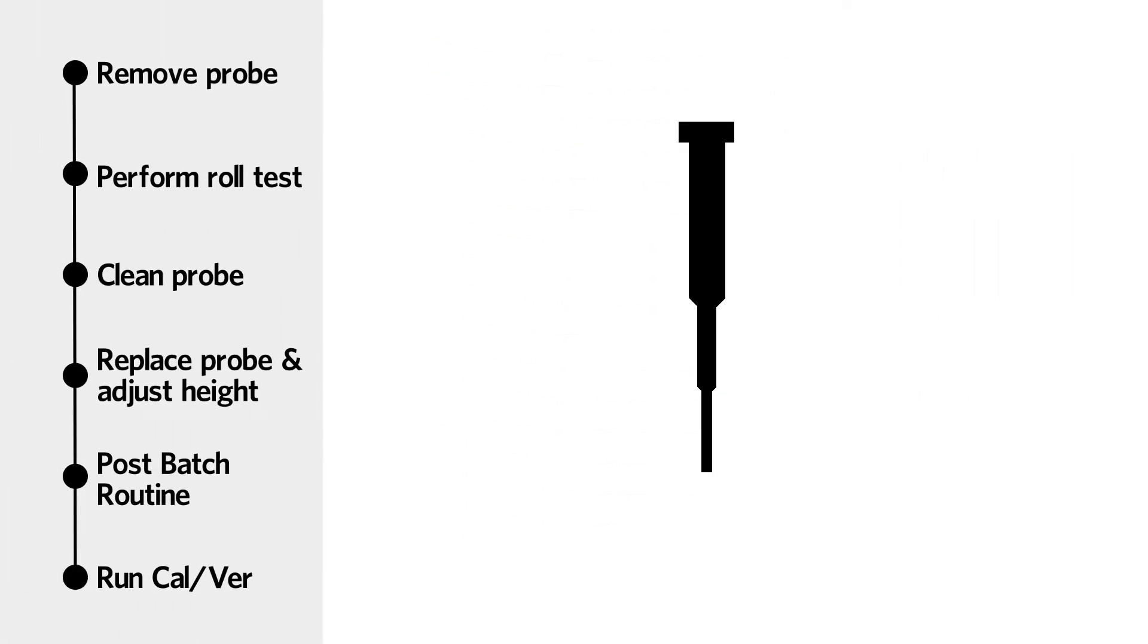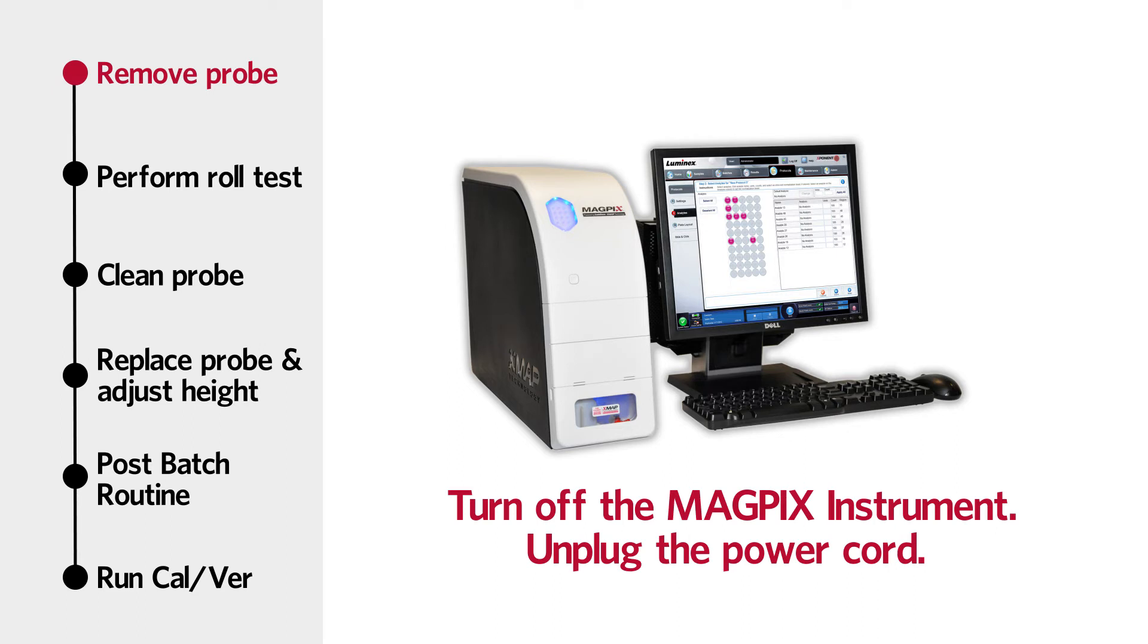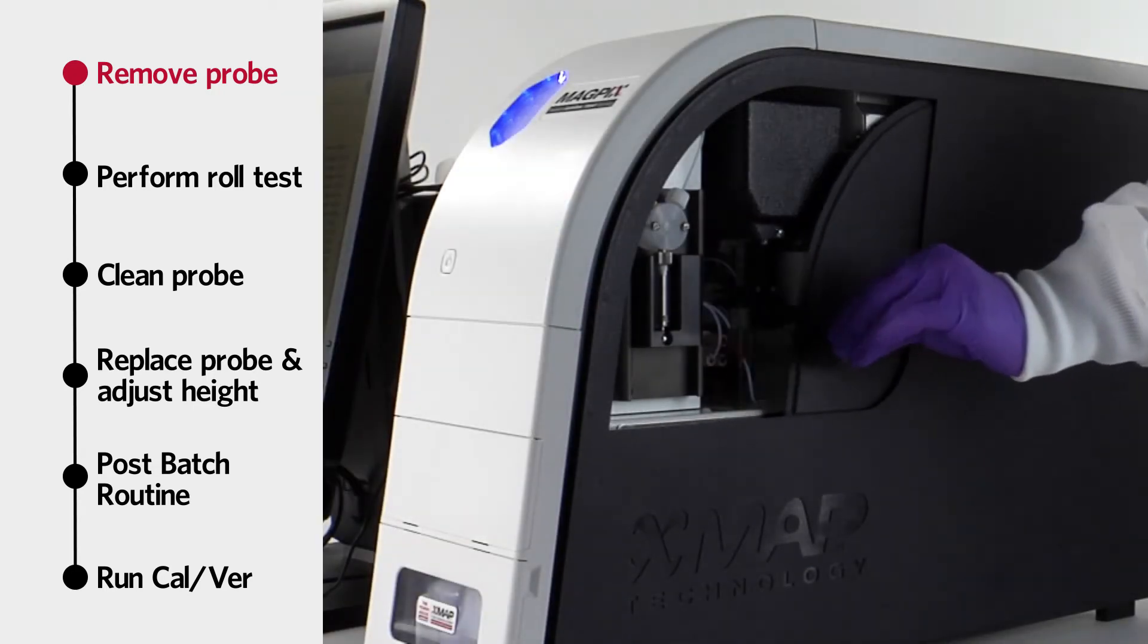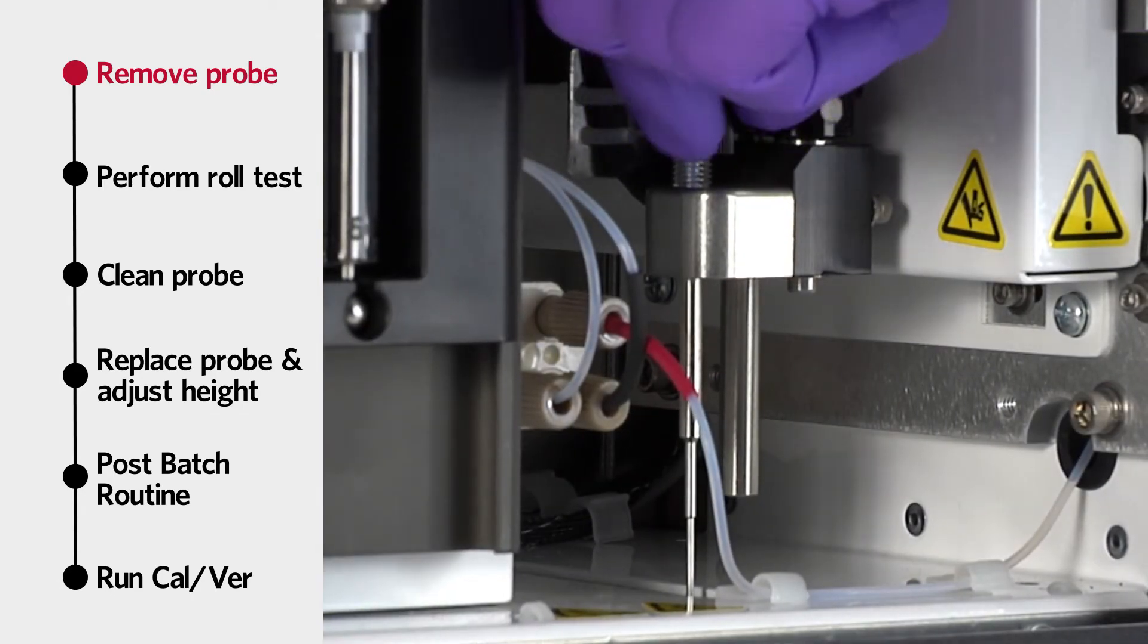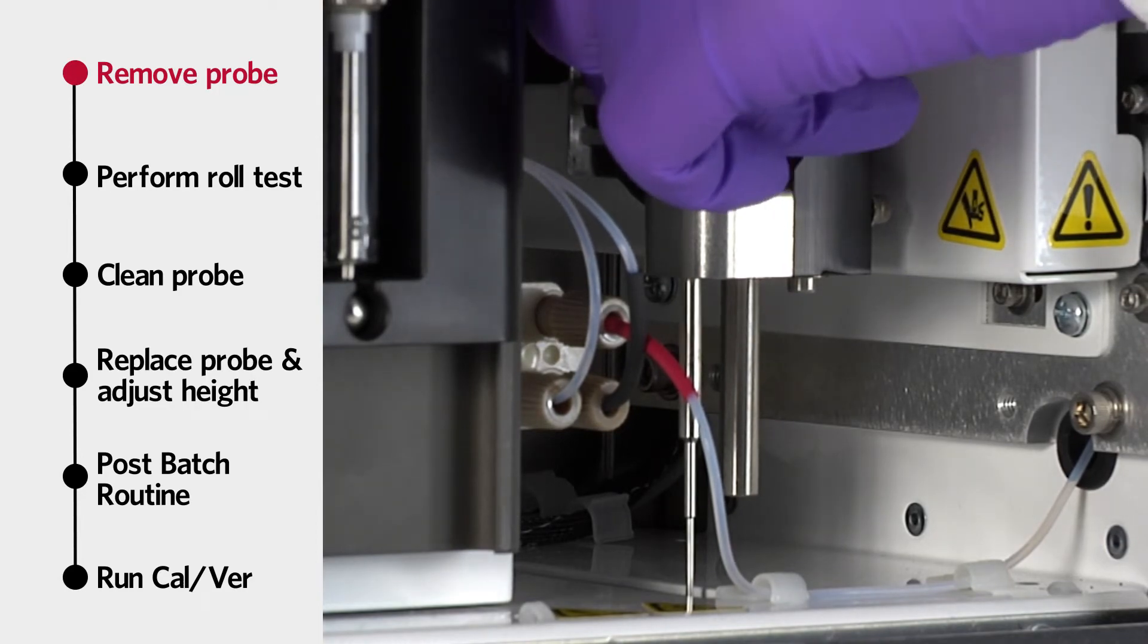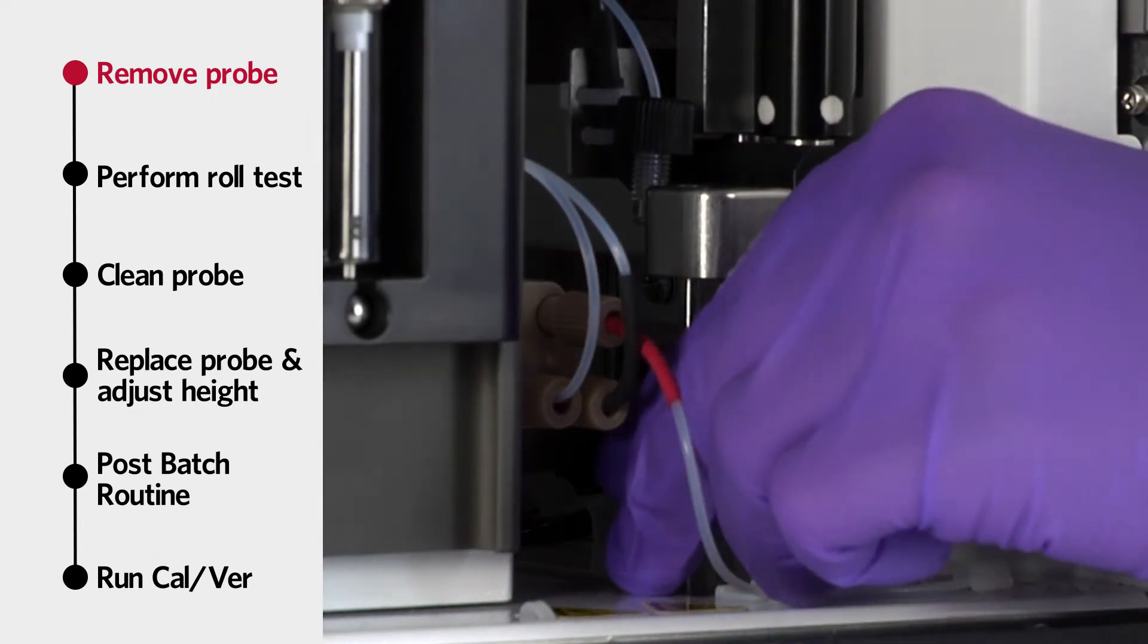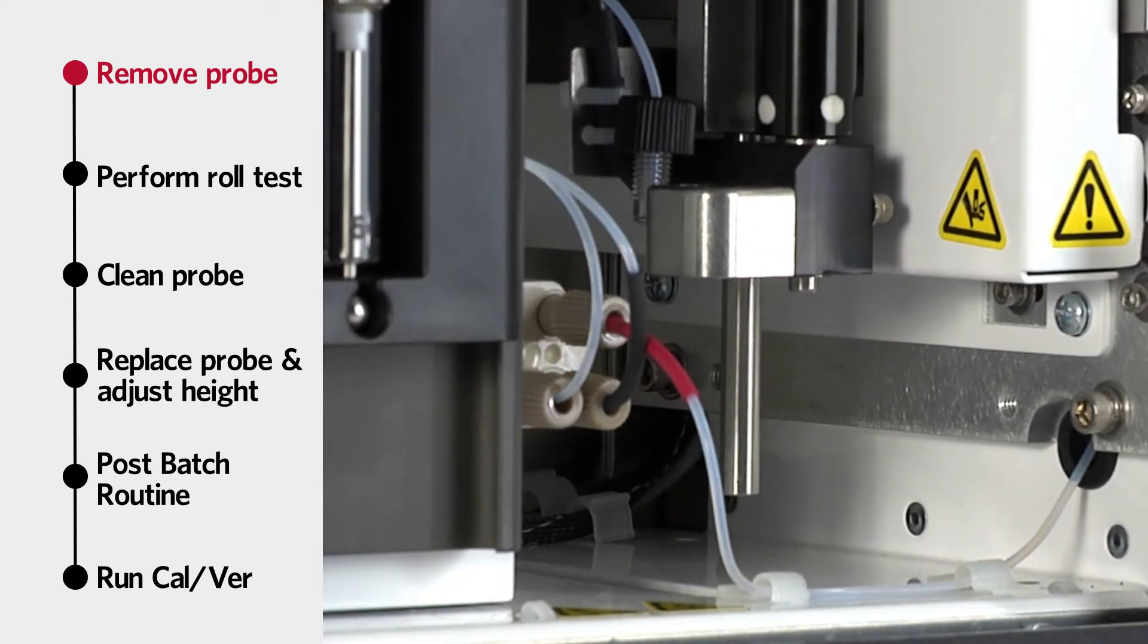To clean the sample probe, remove the probe from the instrument. Please note, turn off the MAGPIX instrument and unplug the power cord before attempting this maintenance procedure. Open the side access door of the MAGPIX. Then completely unscrew the sample probe fitting on top of the sample probe holder. Grasp the sample probe gently and push up. Lift the sample probe out of the instrument.